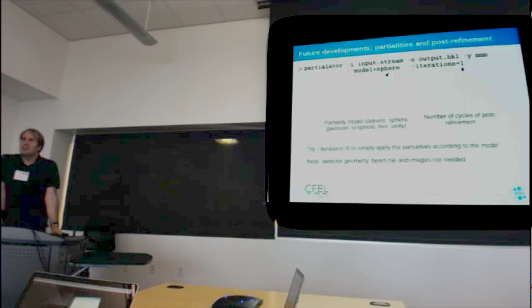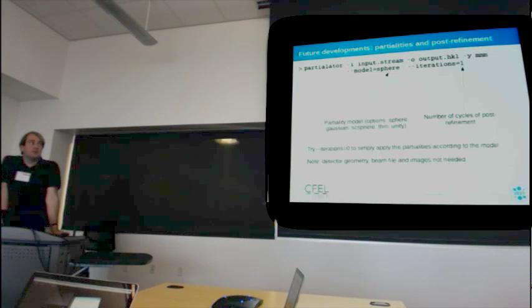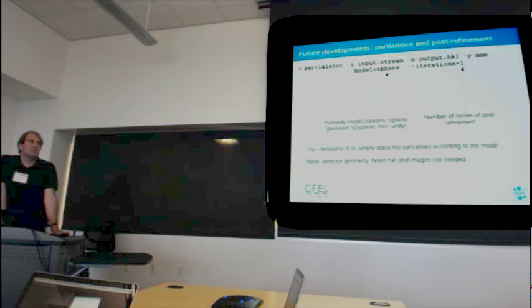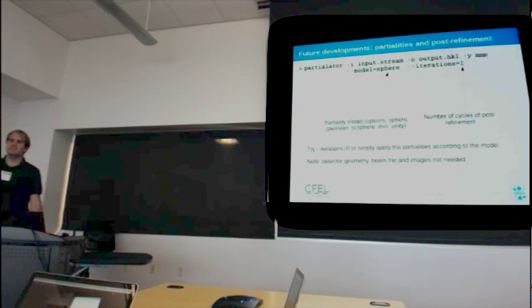I haven't tried it. I have tried simulating using pattern_sim, which does almost the same as what you described. You can give it a try. What I find when it doesn't work is not that the refinement doesn't work, it's that the model just doesn't do as it should do. Yeah, I've got some graphs.